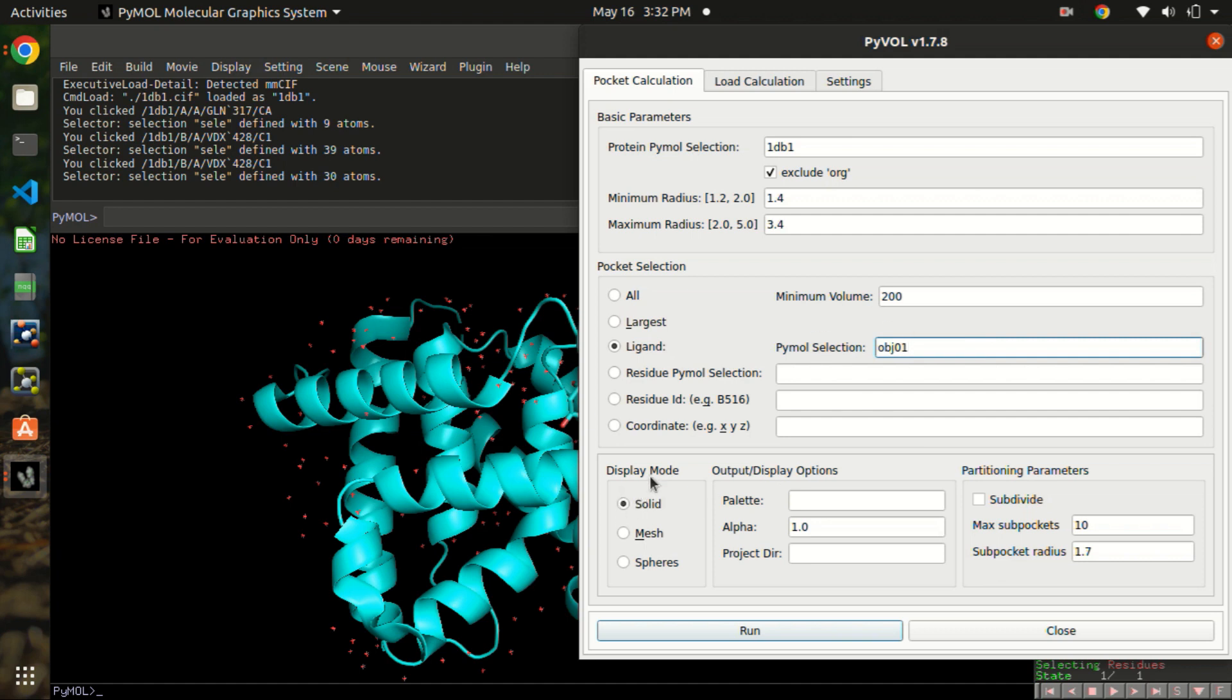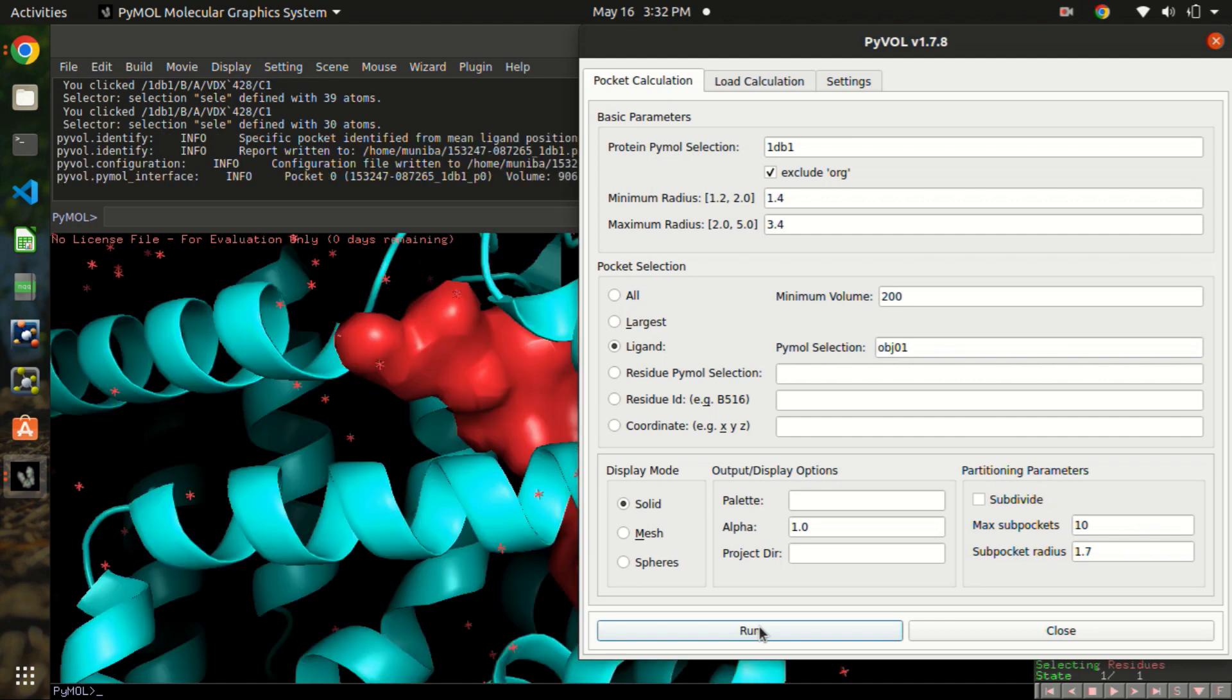We are going to keep the display mode as solid and we are going to keep the default options. Then run. It may take a few minutes. Oh, it was really fast.